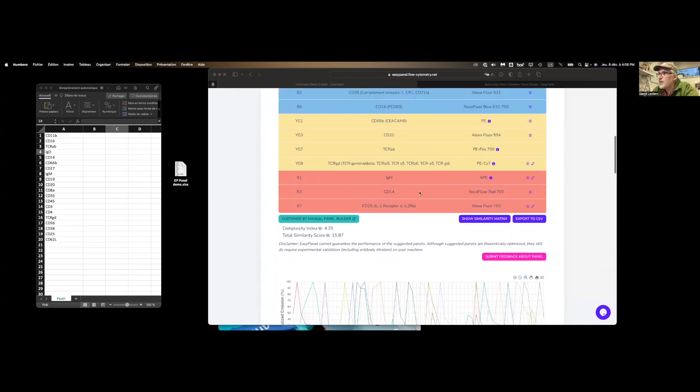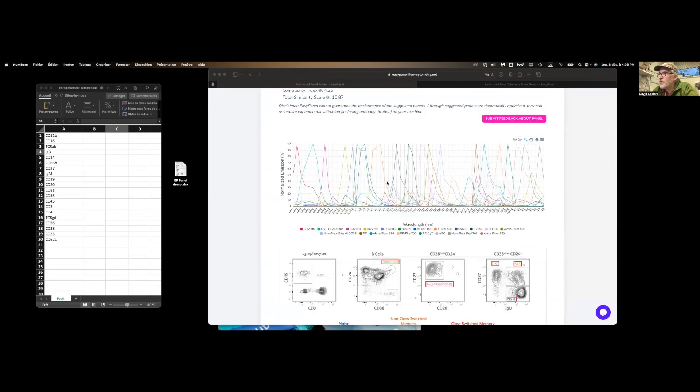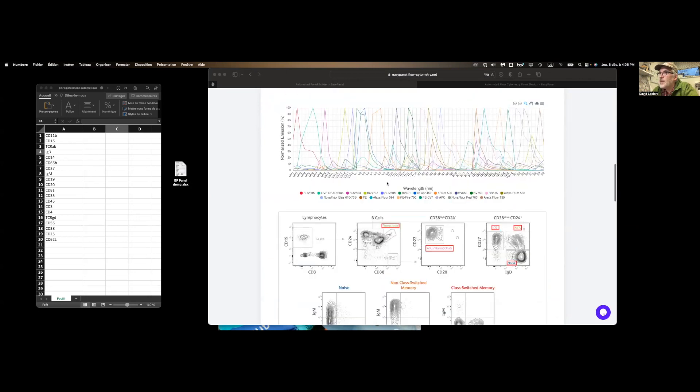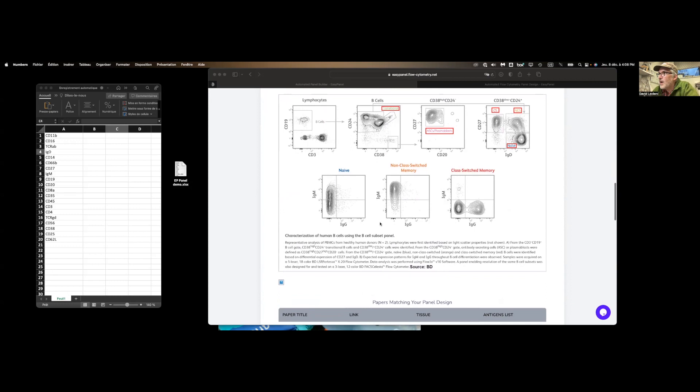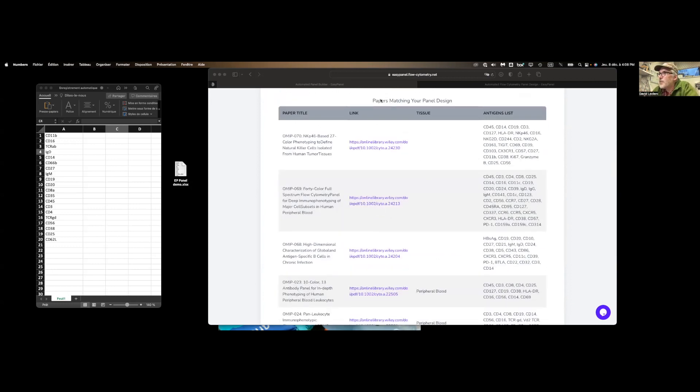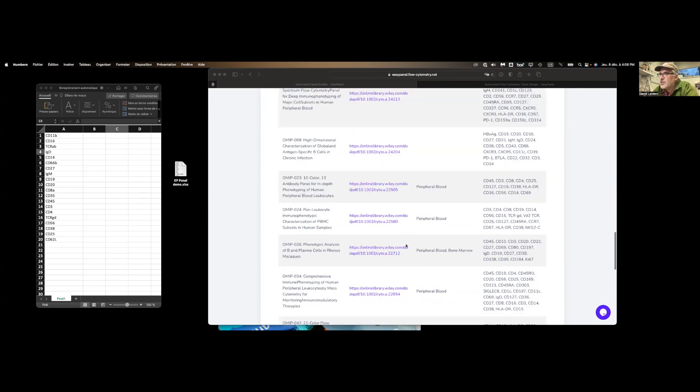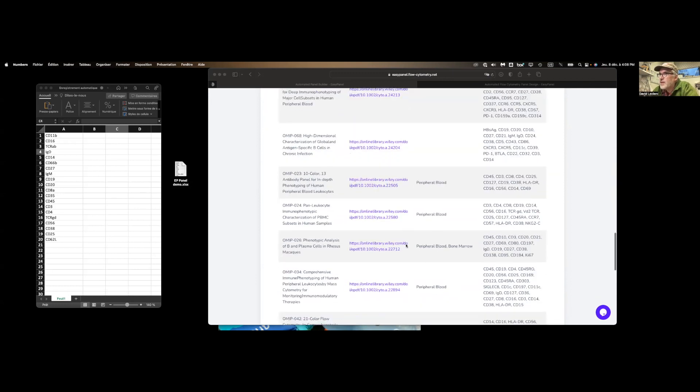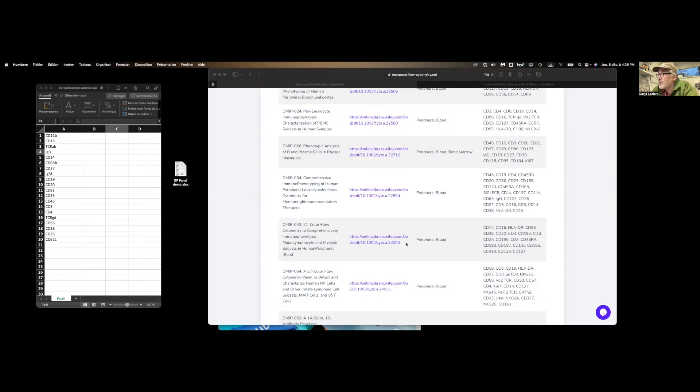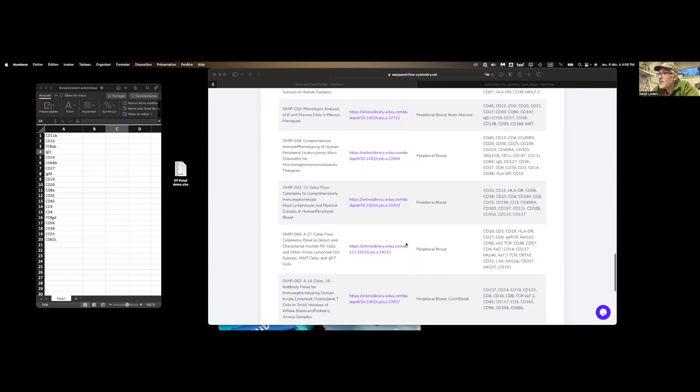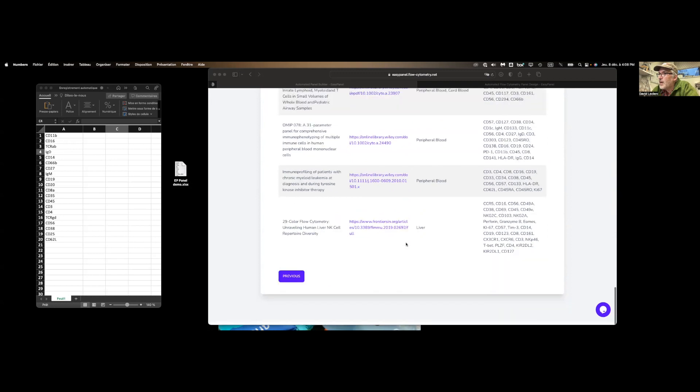The other thing we get is the spectra viewer of the panel we just generated. The EasyPanel recognizes the panel we're trying to run here and will suggest additional information. So for example, it thinks we're interested in this characterization of human B cells graph over here. So we can go see if we can find more information online. There's a list of papers that match the panel as well. These are all OMIPs at this point. So you can click on those and go see if you can find more technical information, presumably about that particular staining.